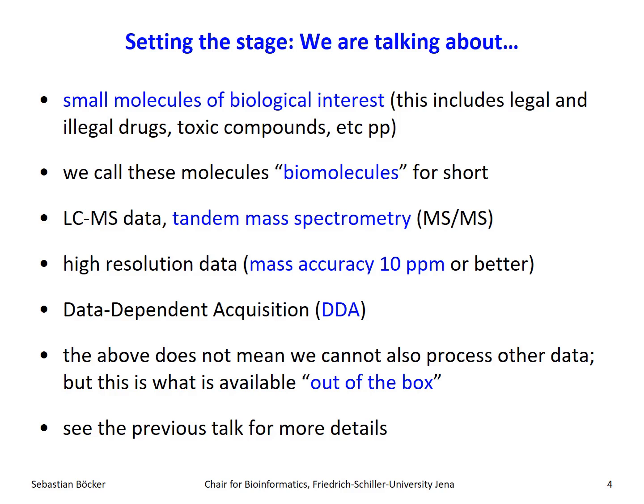I'm talking about data-dependent acquisition, DDA, or more precisely, I assume that your compounds got separated, so every tandem mass spectrum only contains a single compound, or more precisely, billions of copies of the same compound, but not two compounds that have to be separated, as it is the case for DIA.